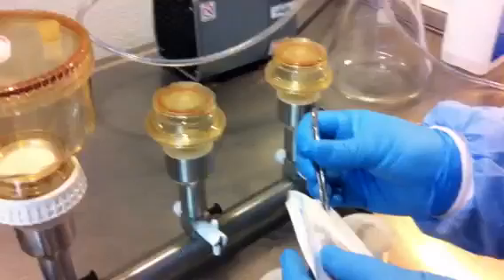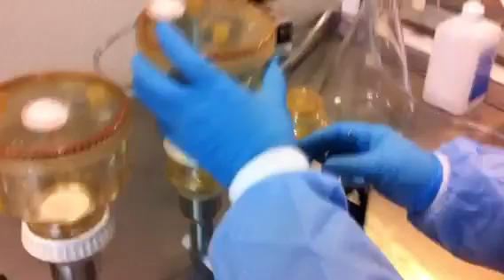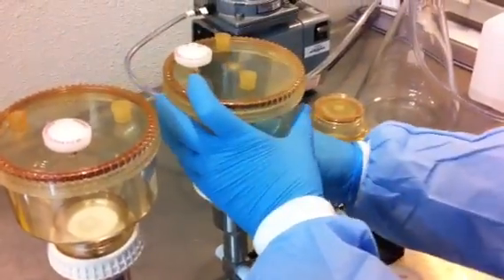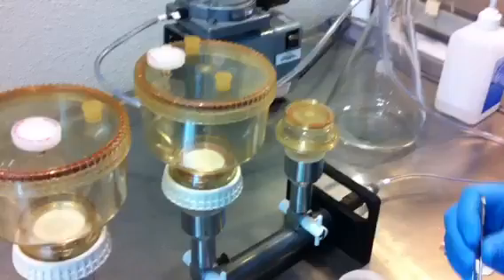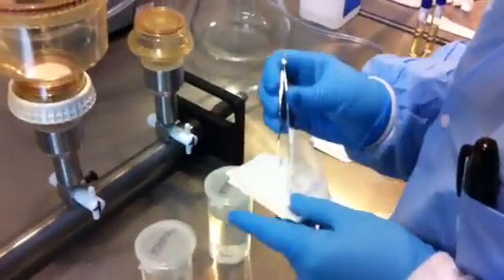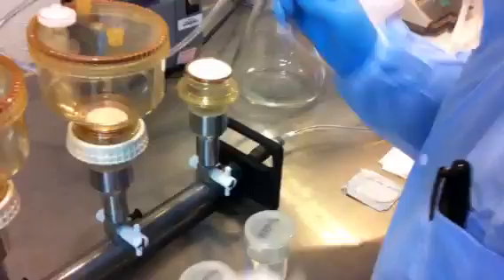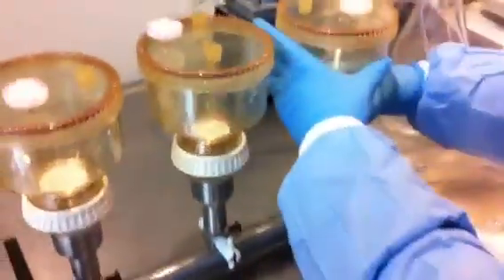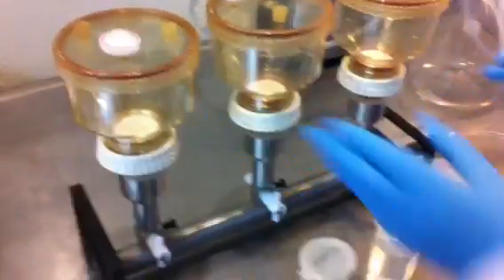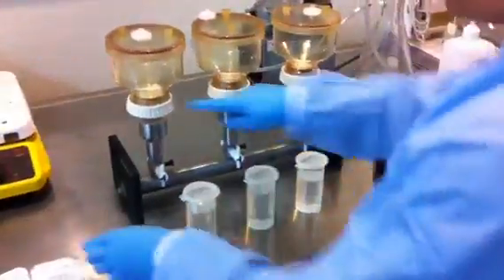Aseptically removing the sterile filter, placing it on to the frit, and attaching the funnel. And here the last filter, and the funnel, and lock it in. So now we have the funnel set up on the manifold, and we're going to continue.